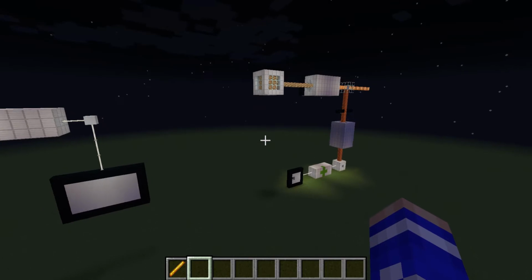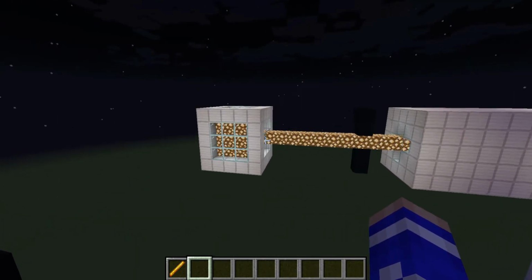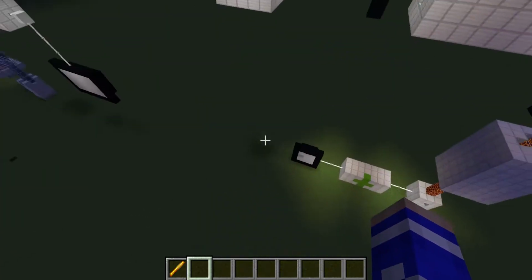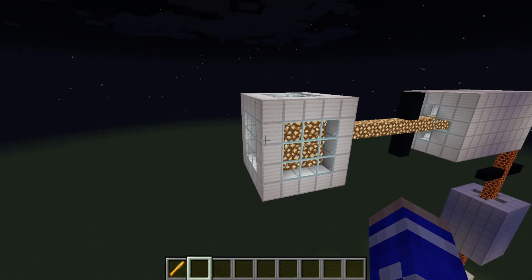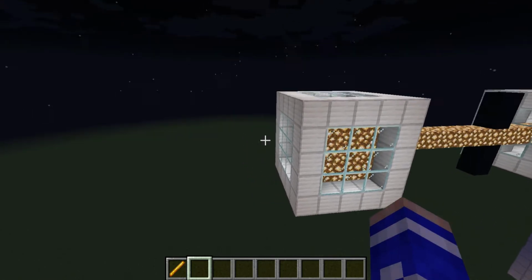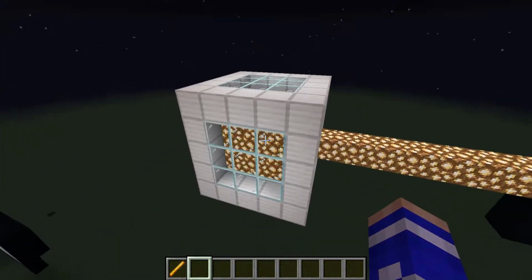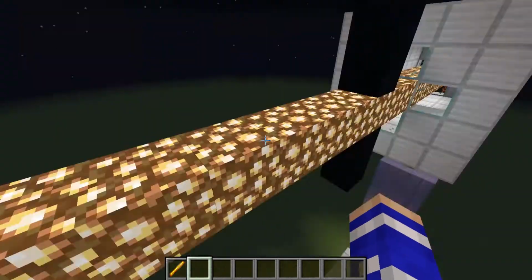The last one we are going to look at is fluorescence spectroscopy. This is this machine here, and just looking at its schematic. So we have our light source. I'm not entirely sure if it needs to be specific or not, but the one that we're using in lab is a xenon lamp. So the light is going to come out of our light source.